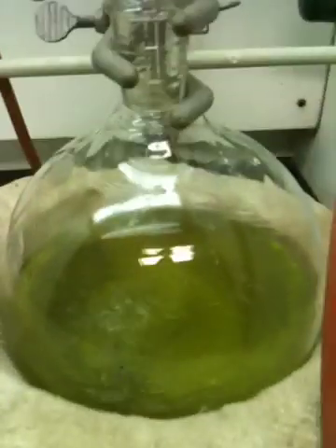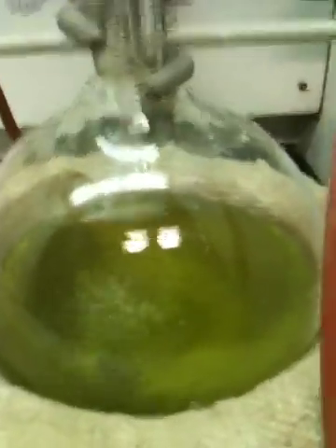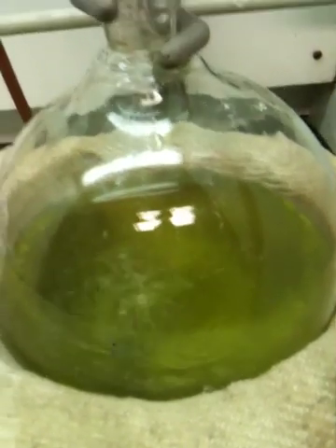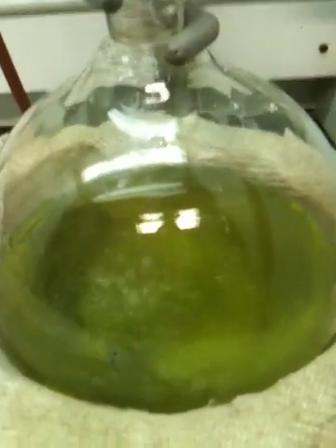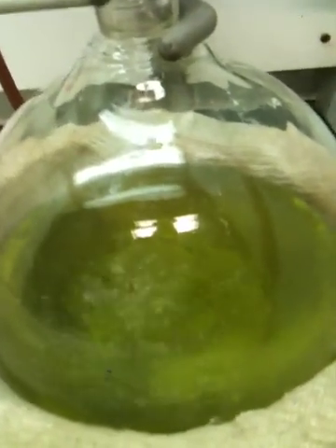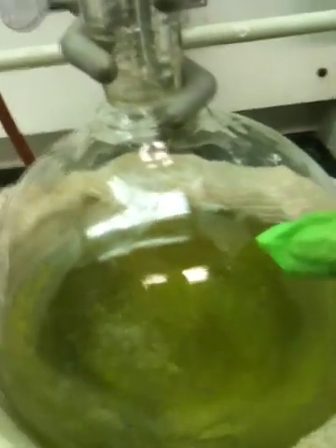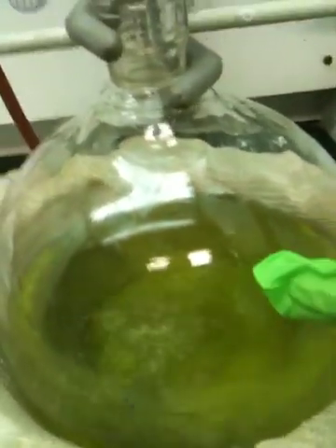The liquid drained through here into the pot. What did the liquid contain? It contained dichloromethane and various organic molecules. That is why the liquid in the bottom is dark colored. When it goes in the pot, it starts boiling again. What vaporizes is just dichloromethane, leaving the caffeine, the chlorophyll, and other organic molecules in the pot.